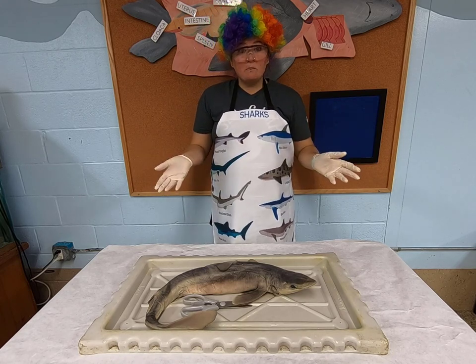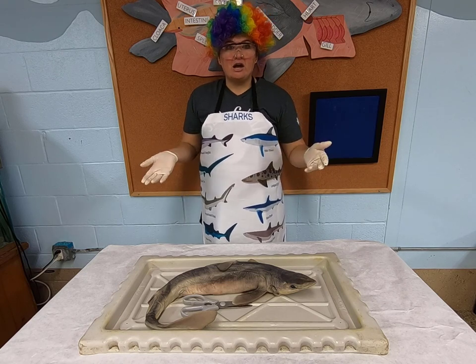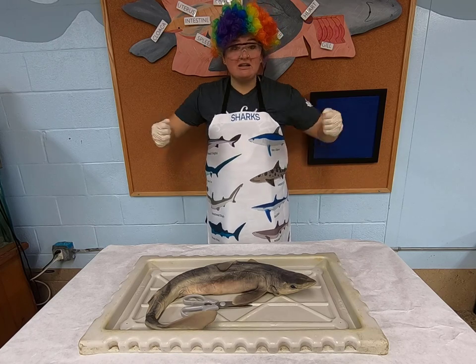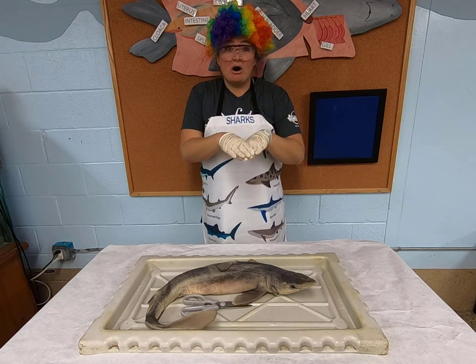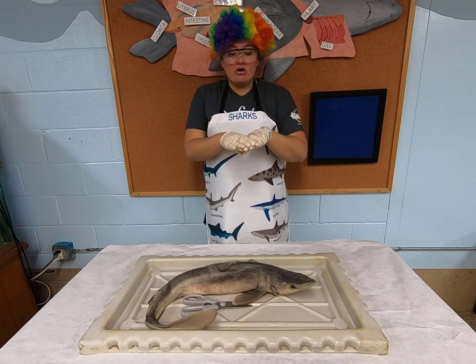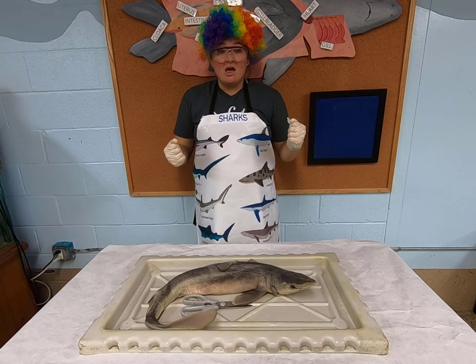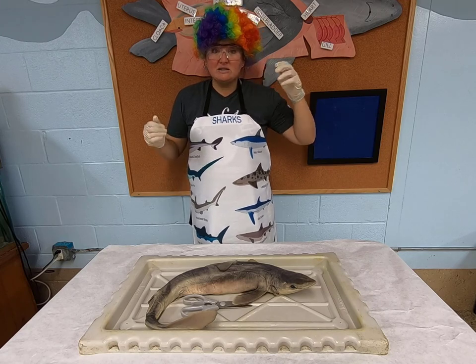There are some sharks, like the nurse shark, that have muscular gills. So they can keep moving their gills in a wave-like motion, and that allows them to breathe when they're sitting at the bottom. You can see these a lot of times at aquariums, where they have those muscular gills, and you can see them moving and pulsing.